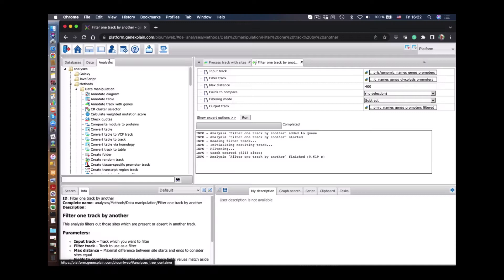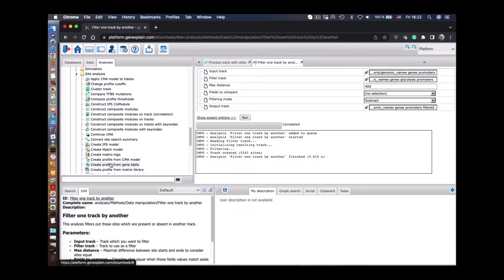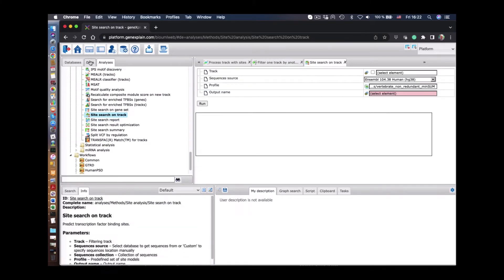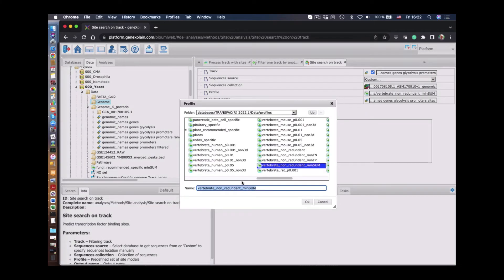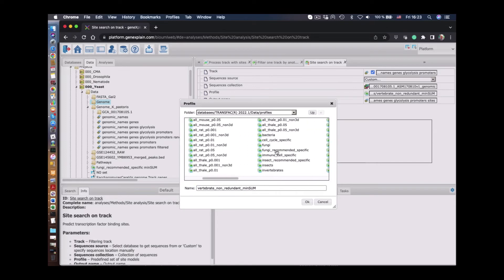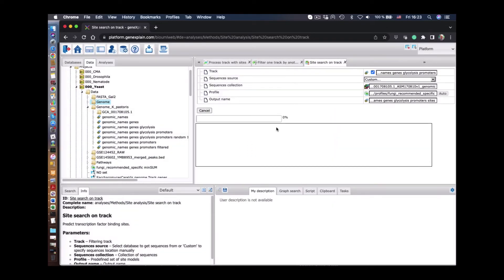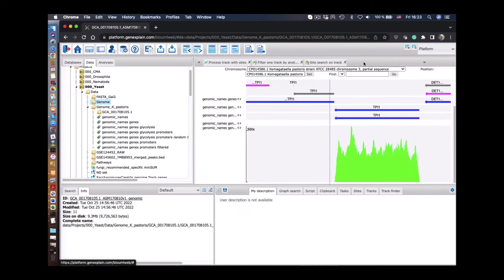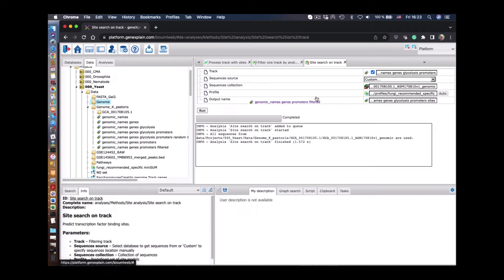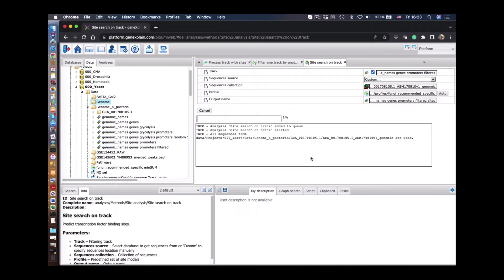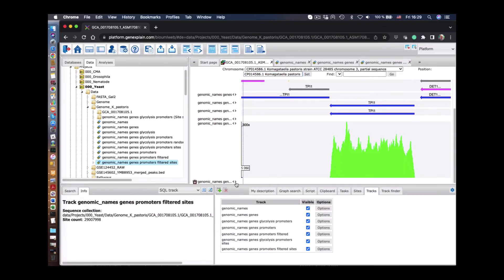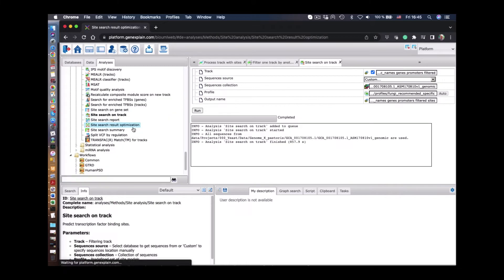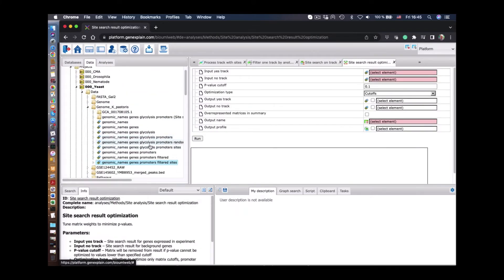Now we search for transcription factor binding sites in those tracks. For that we start a function called 'Site Search in Tracks'. We input the promoter track of glycolysis genes and define the profile, which is for fungi position weight matrices, and apply it. The sites are found, and the same analysis is applied for all other promoters in the genome. We now find sites in the promoters of other genes — the non-glycolysis genes — and these will be used as a background set.